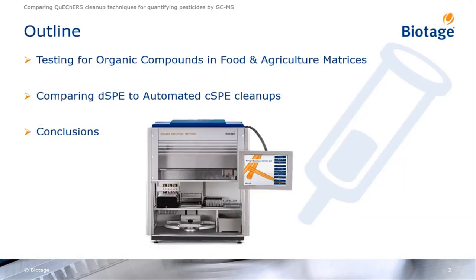So a quick outline of what I'll be presenting today. I will briefly be going over what laboratories are thinking about and considering when testing for organic compounds in food and agricultural matrices. I will then jump right into comparing DSPE, or dispersive SPE, to automated CSPE, or column-based SPE cleanups. And then we'll finish it off with some conclusions based on some of the data that we were able to produce with this study.